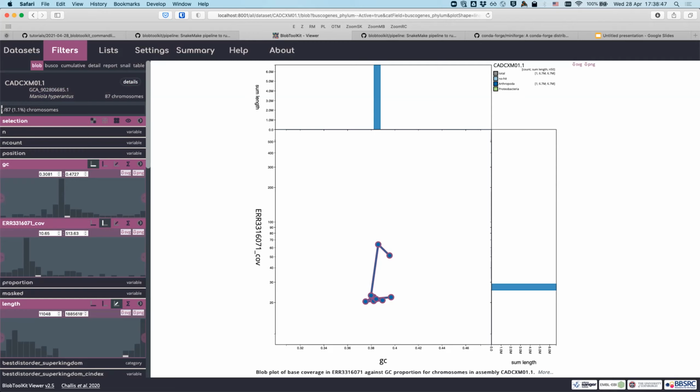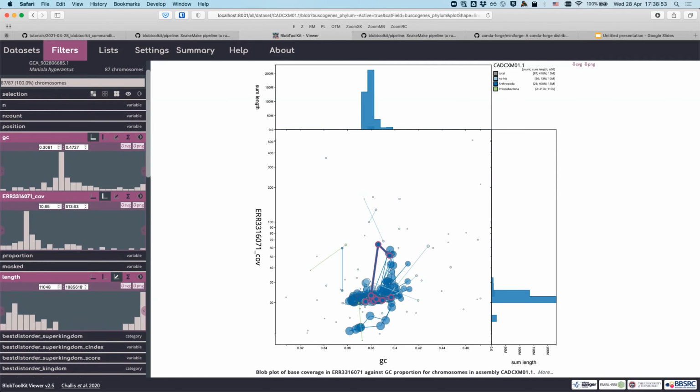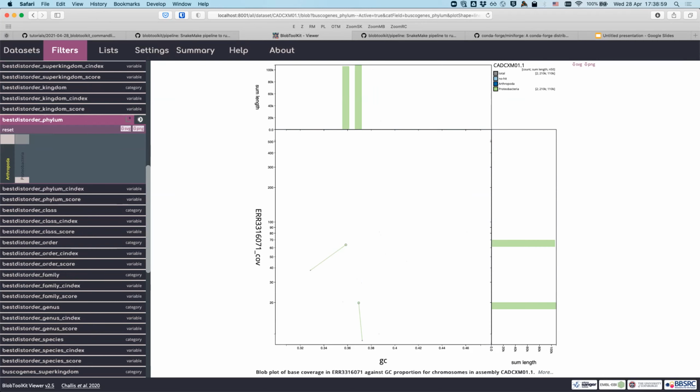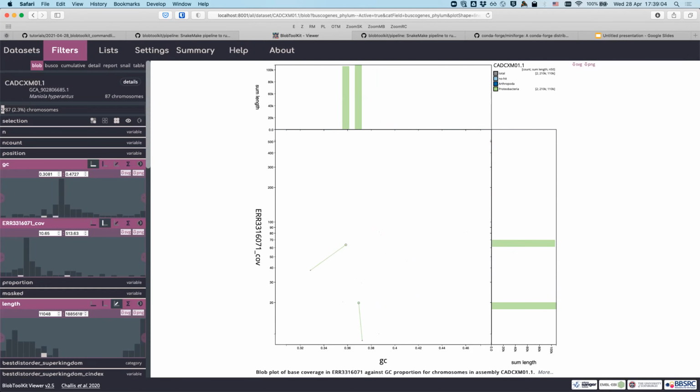So if you remember, one of the Proteobacteria was only 1 small contig. If I go back to that, I remove the selection, I go back to the Proteobacteria over here. And yeah, this one has 2 and this one has 1. Yeah. So having separate BLAST results for the different circles is because that's the way it was BLASTed in the pipeline. Yes. Right. Good.